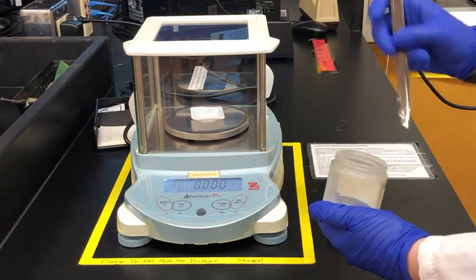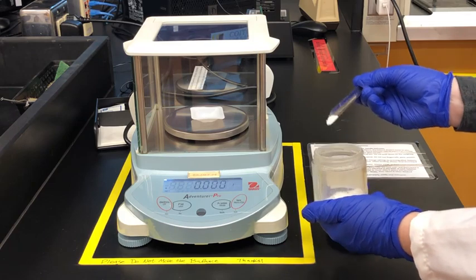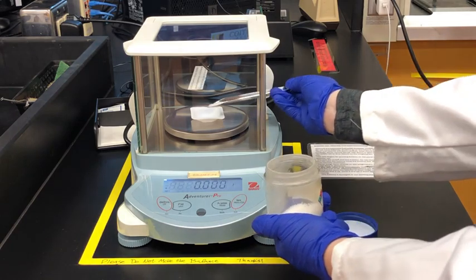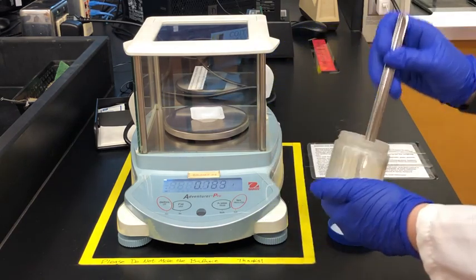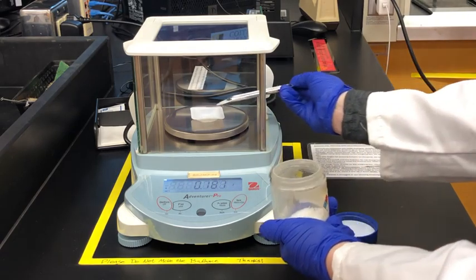Here I'm going to carefully scoop some of the impure aspirin into the weigh boat and we're going to try to weigh out about 0.25 to 0.3 grams.